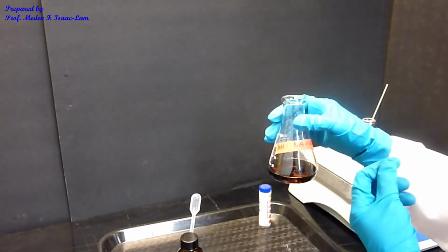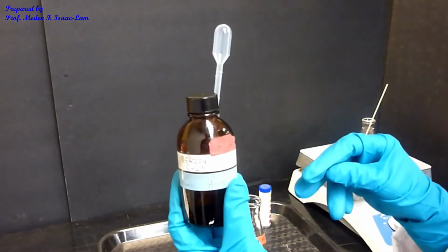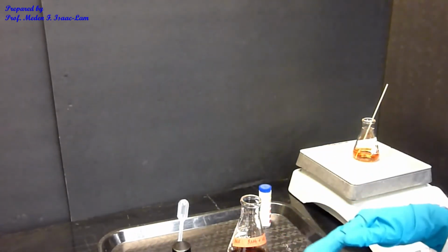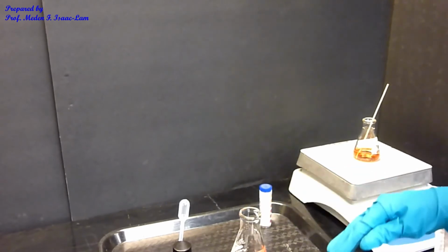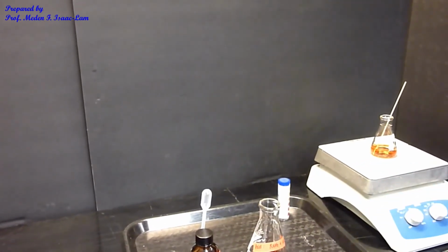So I'm now going to add the reagent, which is benzoyl chloride. We are going to derivatize the amine and make a different functional group, which is an amide. And then I'm also going to make it basic by adding 6 molar sodium hydroxide.